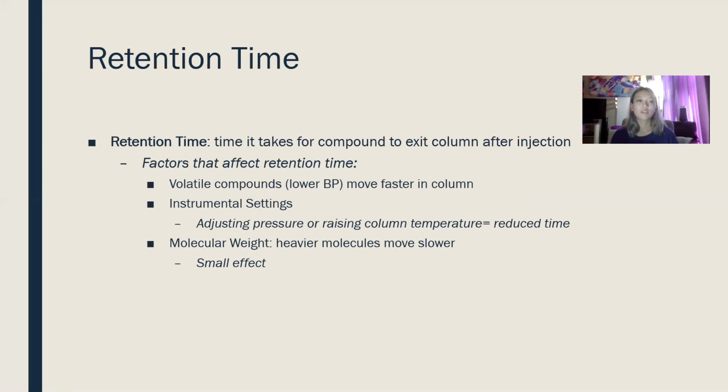That means that, for the most part, we separated the mixtures really well, obviously, because that was our goal. But that's why retention time is really important, because that way we can get our data and see exactly our substances.